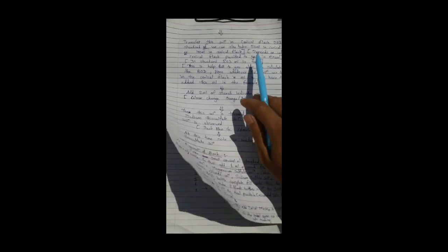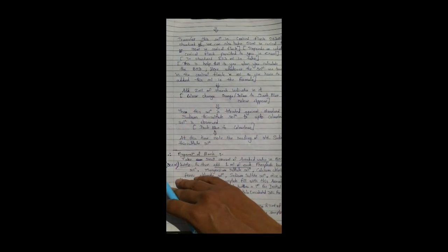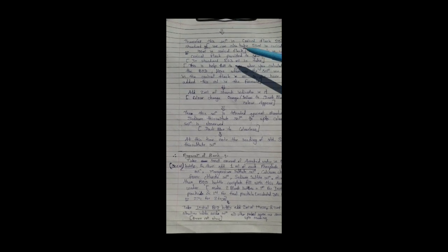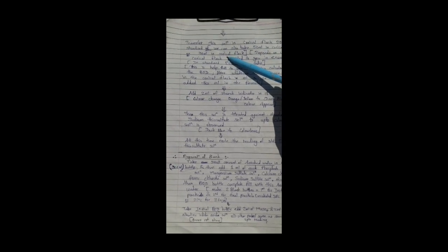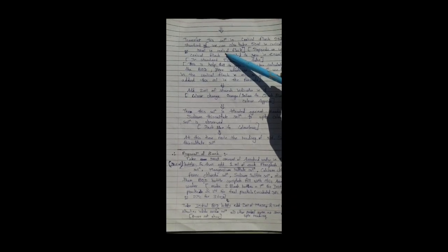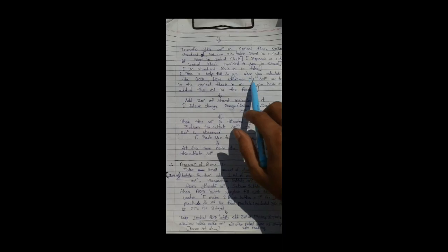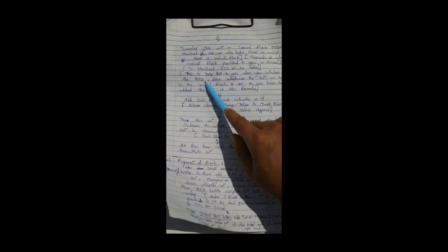Most of the time the department provides you a 50 ml conical flask or a 100 ml conical flask. If a 50 ml conical flask is provided to you, then you have to add 50 ml of the sample in the conical flask. If a 100 ml conical flask is provided, then you have to add 100 ml of the sample. It is the same for the blank and the sample. This is helpful to you when you calculate the BOD.